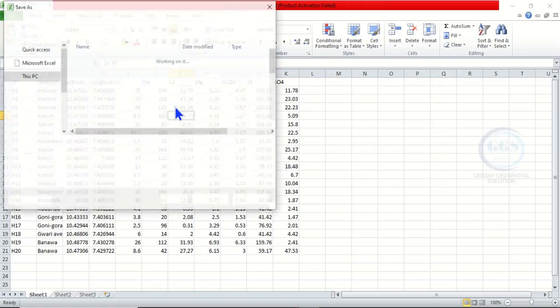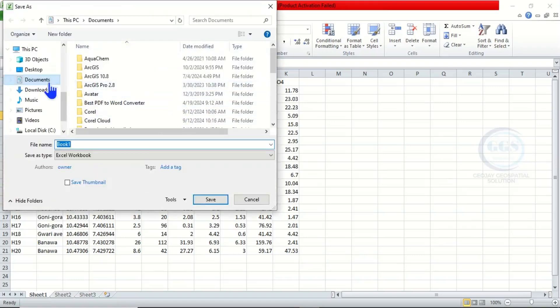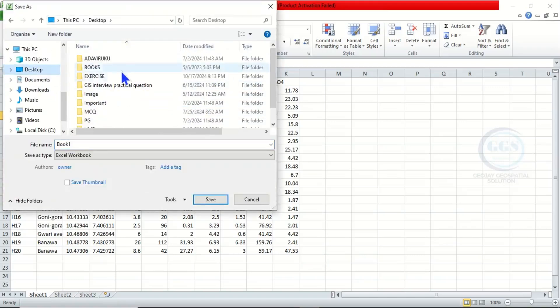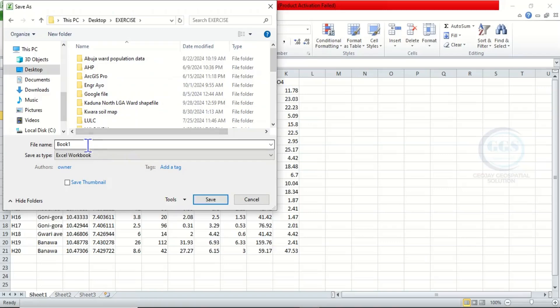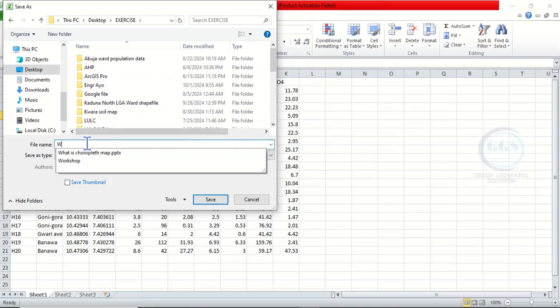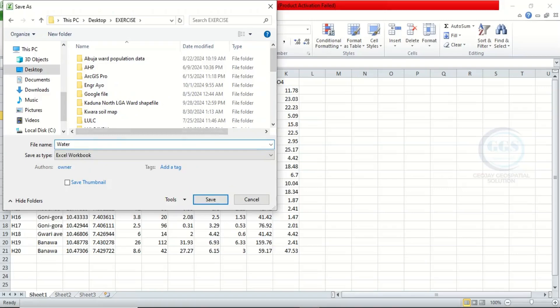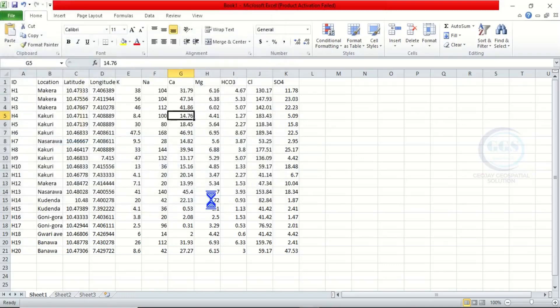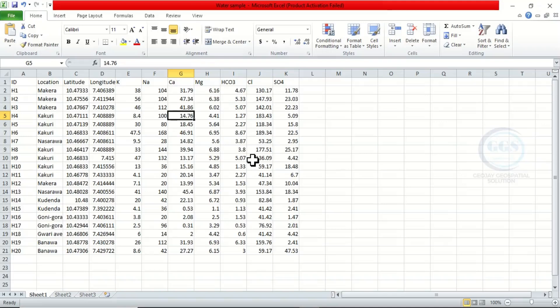Then you have to save this in your working folder, so click on Save. Let's save it in this exercise folder. Let's name it as water sample and click on Save. Now we have saved our data. To plot it, we need a software called Grapher. In a previous video, I've done a video on how to install Grapher, so you can check the description box to watch that video.